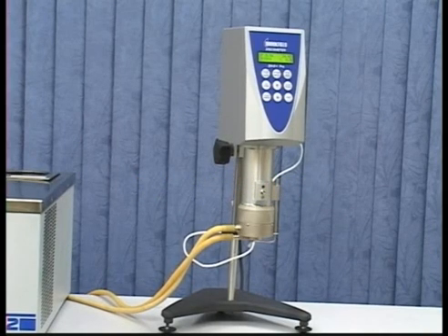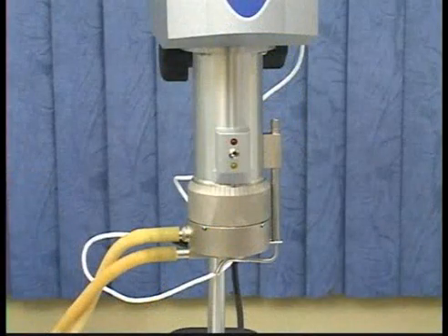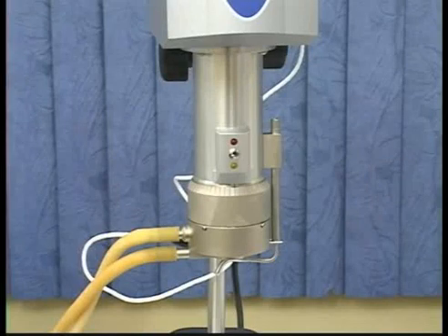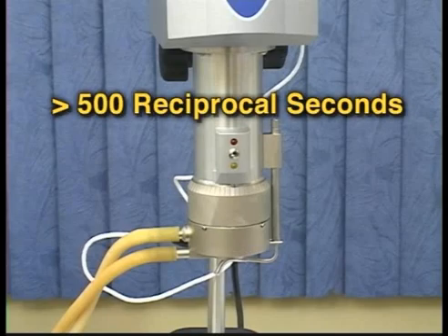To ensure your viscometer is working properly, a periodic calibration check is essential. To perform a calibration check with the Wells Brookfield Cone Plate Viscometer, you will need a silicone or mineral oil viscosity standard fluid. Mineral oil is the preferred choice for all calibrations performed at Brookfield. It is required for use with cone plate viscometers at viscosities above 5,000 centipoise and at shear rates above 500 reciprocal seconds.